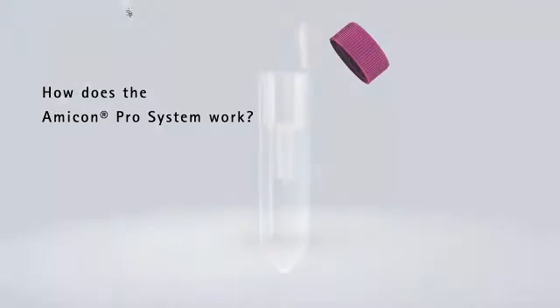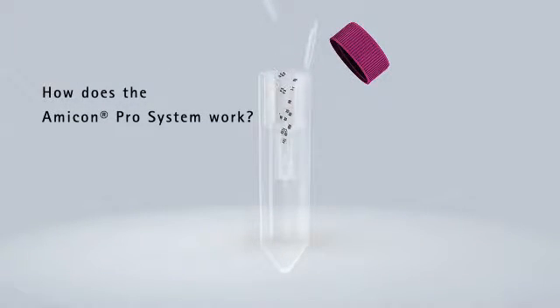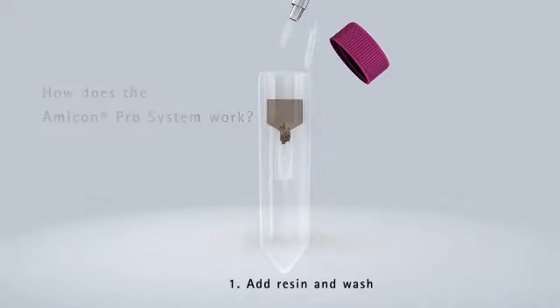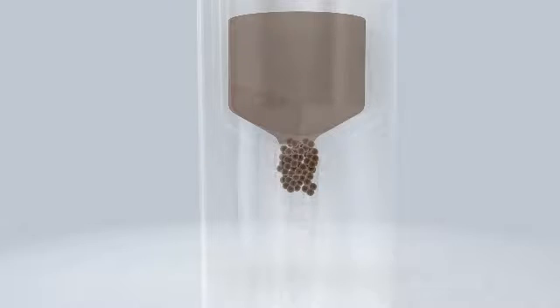How does the Amicon Pro system work? First, load the device with your resin and equilibration buffer of your choice. The resin forms a packed column in the exchange device for optimized binding.